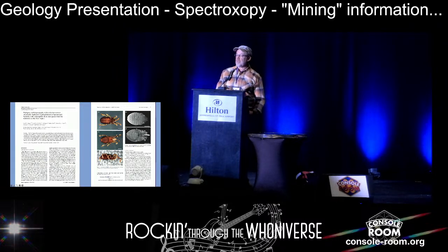But the best images that we see for this typically are things with a lot of topography. And it's a wonderful instrument for that. Another thing I didn't mention, that we're really fortunate to have this lab, we call it the Tech Lab. They put up some money quite a few years ago.